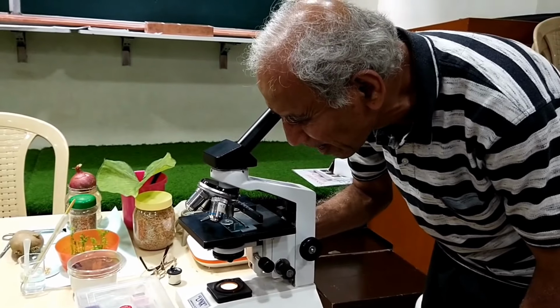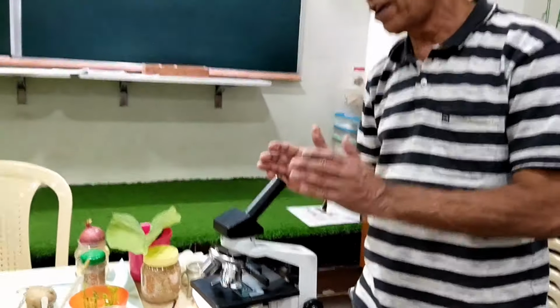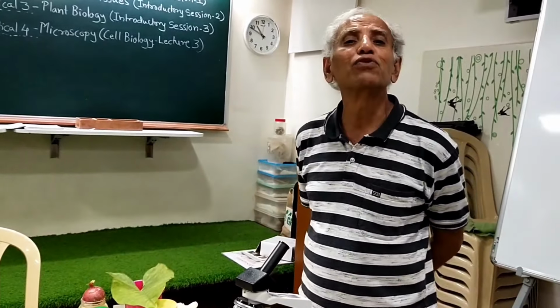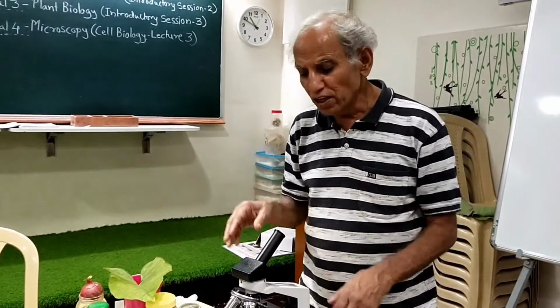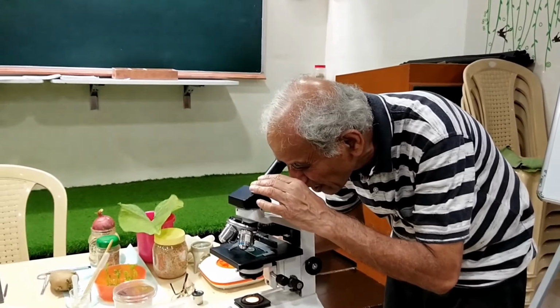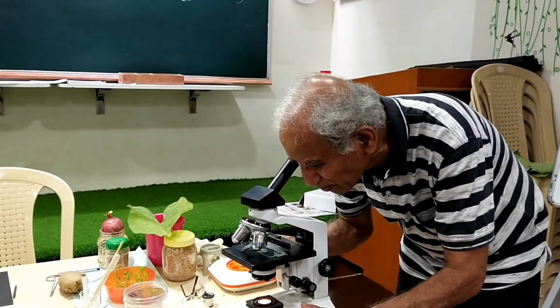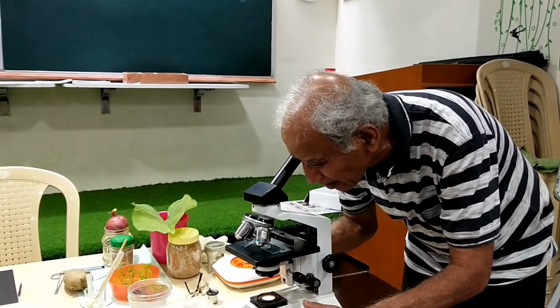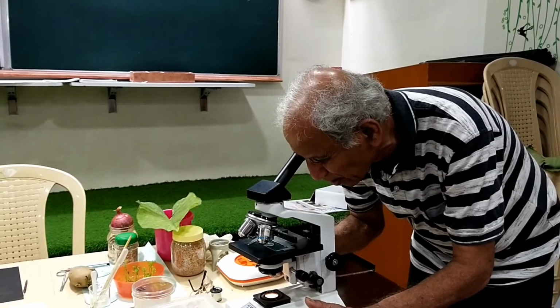Oh my God, I got the raphides. Some of the air spaces here are full of raphides. I told you on the board that it is the parenchyma cells which have the raphides, but then there are raphides also stored into the spaces. It's very, very beautiful. You can see those air-filled spaces in which the raphides are there, and there are raphides also inside the cells, and many good things. I think it will be good. We will load this picture onto the computer now.